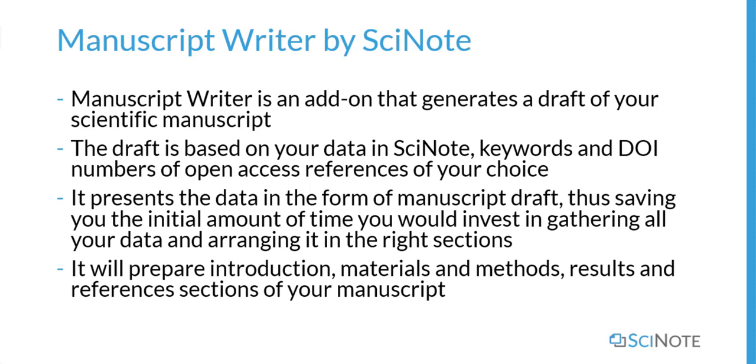The draft is based on your data in SciNote, keywords, and DOI numbers of open access references of your choice. It presents the data in the form of a manuscript draft, thus saving you the initial amount of time you would invest in gathering all your data and arranging it in the right sections.